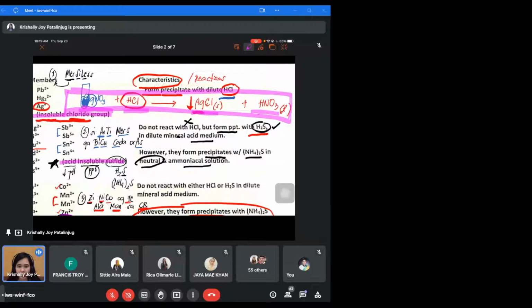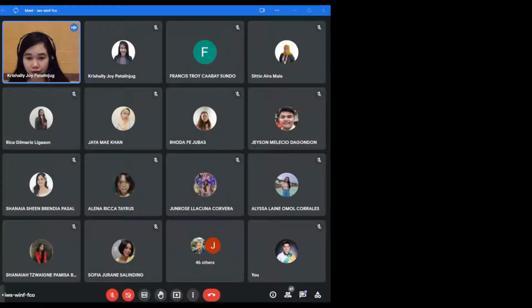Okay? You can identify naman what is being added, and what ion ang mo-precipitate out. So, inyo lang siyang himuon into equation form, or complete reaction. And from this equation, you can identify saan dito yung precipitate. Siyempre, yung may ion of interest, yung silver chloride, yan yung precipitate. So kapag tinanong kayo, what is the name of the precipitate? Silver chloride.